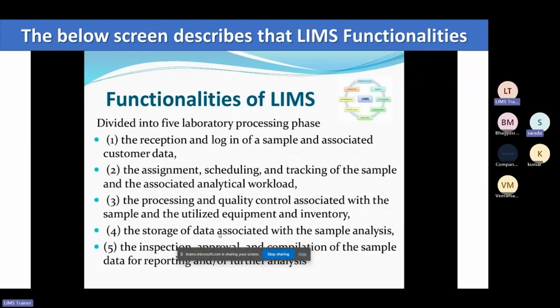The data storage associated with the sample analysis, all the data storage, as I have just said, like archival, is important, so that is a functionality of the LIMS. And the inspection, approval, and compilation of sample data for reporting and for further analysis. So all these activities are the functionalities LIMS provides in a particular laboratory.